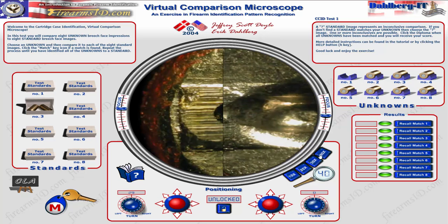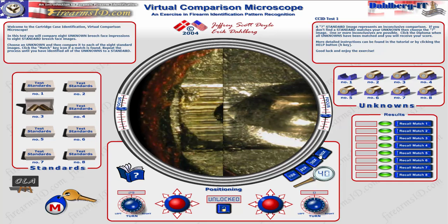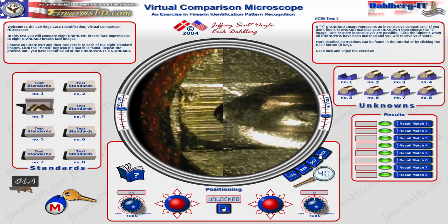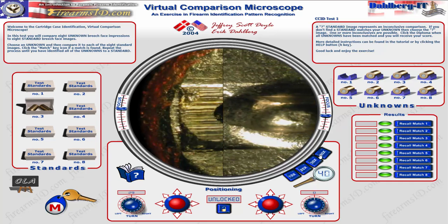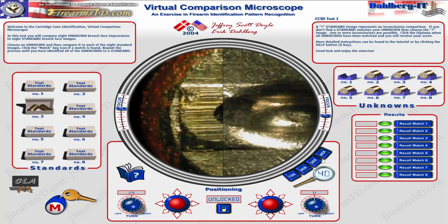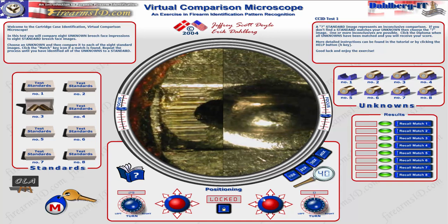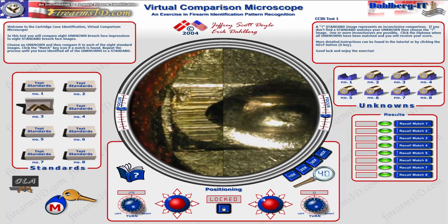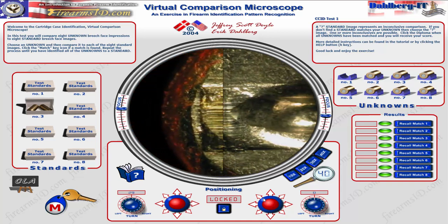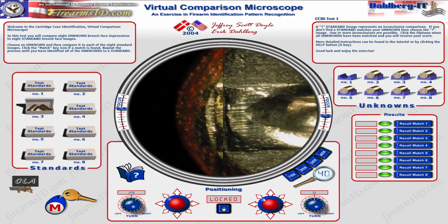I can see striations on the cartridge case and I'm trying to get them to line up so they're in the same spot. Then I click the lock button, and when I move them I can see if the striations line up — and they do. I didn't perfectly rotate it, so I'll unlock it and rotate it a little bit more.